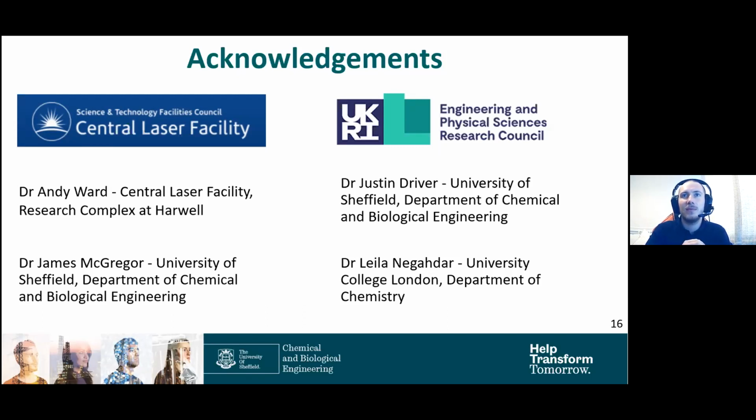I have another one, which is, obviously you've shown this for a solgel type synthesis. Is there any other sort of syntheses you think this optical trapping might be applicable to? Because obviously it's quite specialised. Yeah, I think that it's for any process which uses a flow tube, because it can really replicate those conditions, especially if you've got a more stable, less volatile reaction mixture, more solid or something.